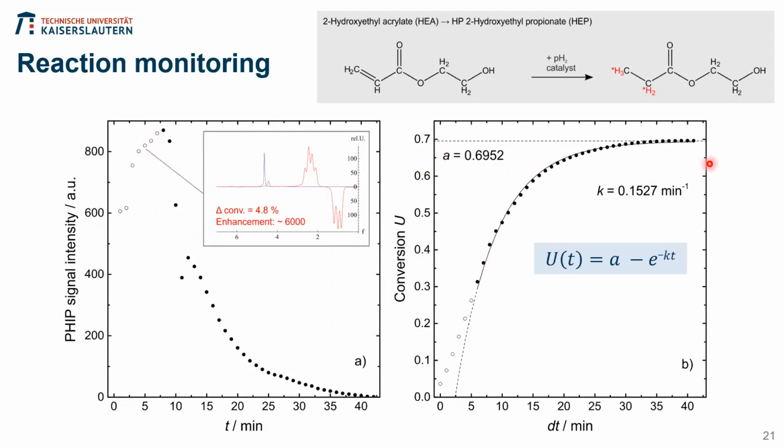So we have a 70% conversion. So the reaction was not complete. And we measured that last value in a high field magnet. And with that, using only the data points without the activation, we can just fit a pseudo first order kinetic model to our data and end up with this reaction constant. And for the measurement in D2O, the reaction constant is almost the same.